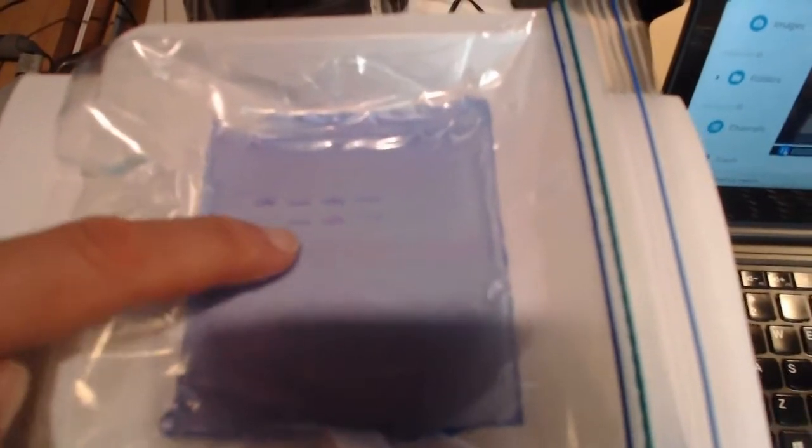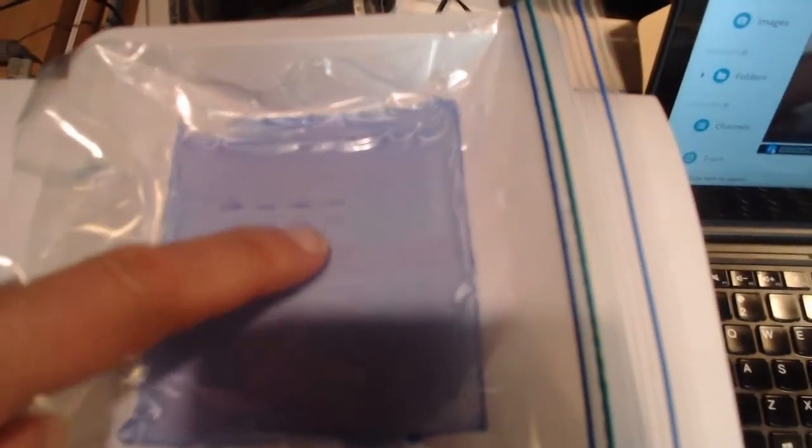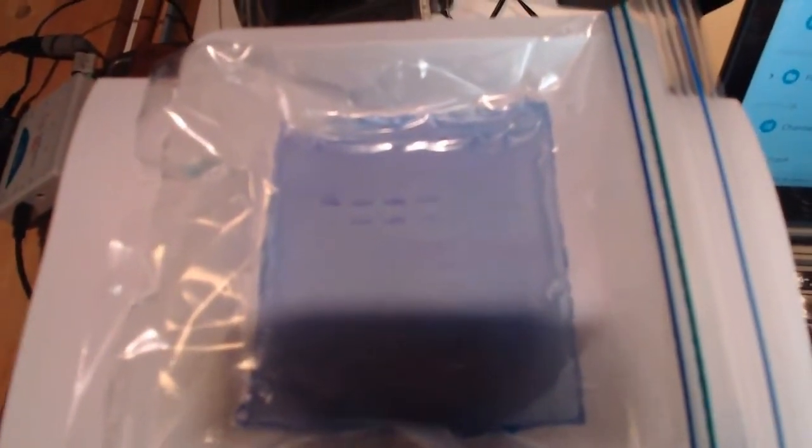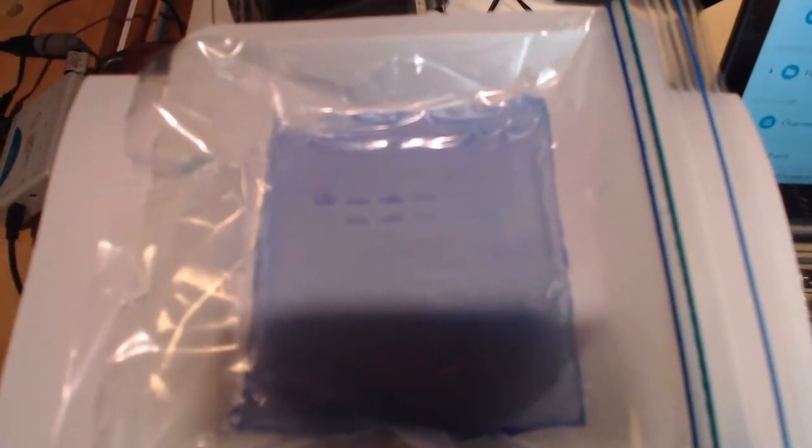You can see they have different patterns here. These two are the same, but this one's a little bit different. The bands are a little bit higher. There are two of them. This just has one band. So we can look at differences in the DNA patterns and tell where a DNA sample came from. This is also known as DNA fingerprinting.